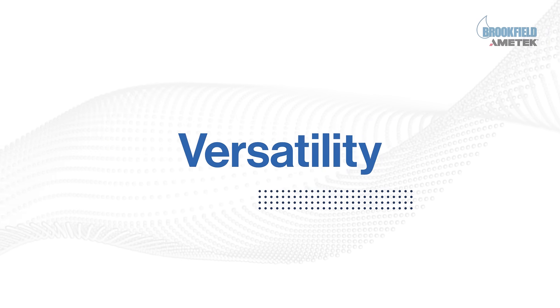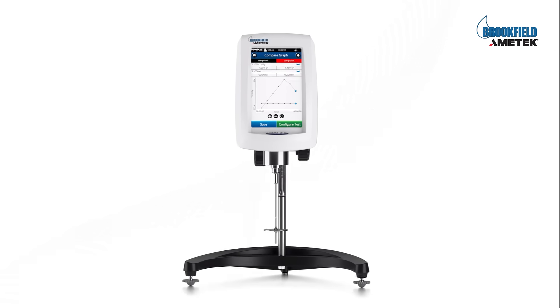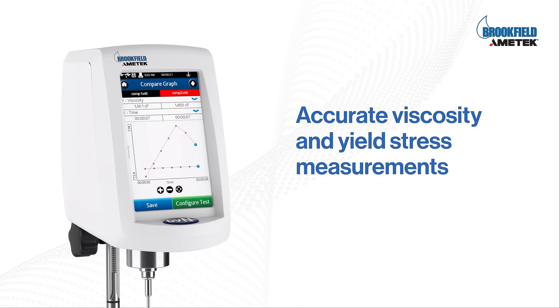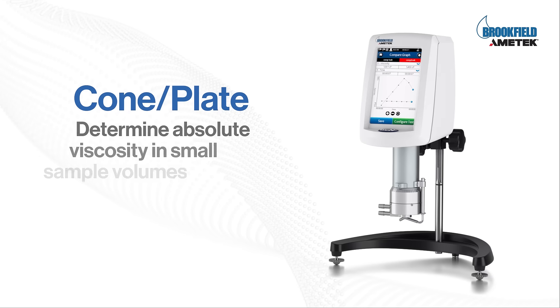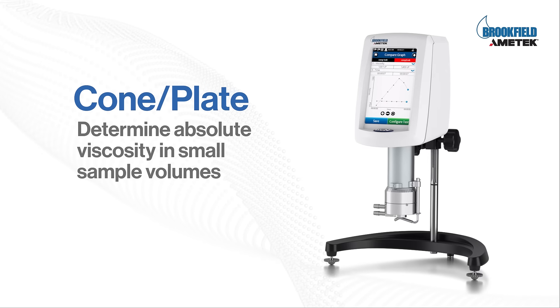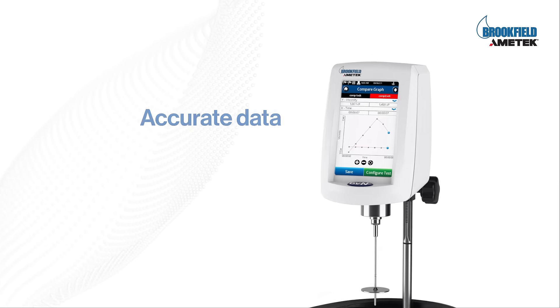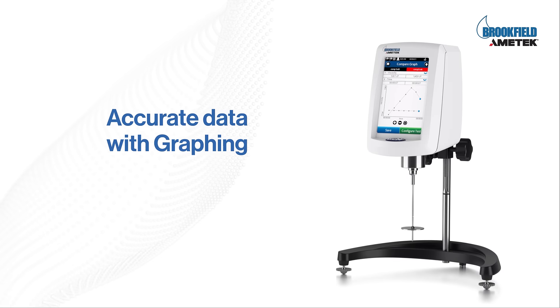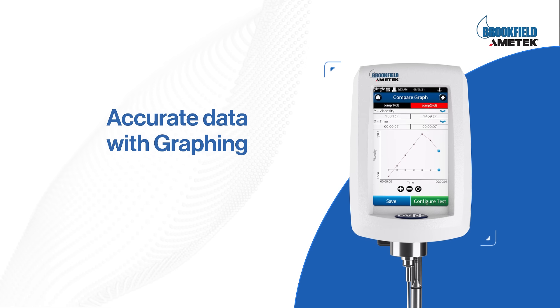Experience a new level of versatility. Ametek Brookfield's DV Next rheometer is here to provide precise viscosity and yield stress measurements. The cone plate version provides absolute viscosity for small sample volumes. The DV Next rheometer comes with a variety of advanced features designed and manufactured to the highest standards. It incorporates a 7-inch touch screen that provides all rheological measurements at your fingertips.